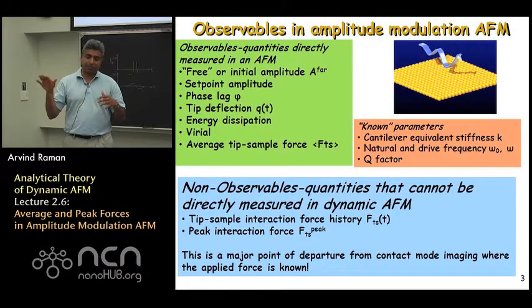The other part of this profile of this interaction force would be the peak force. What's the maximum force that you actually apply when you are tapping on the sample? These are all what we would consider as hidden observables, or non-observables, or hidden variables, let's say.